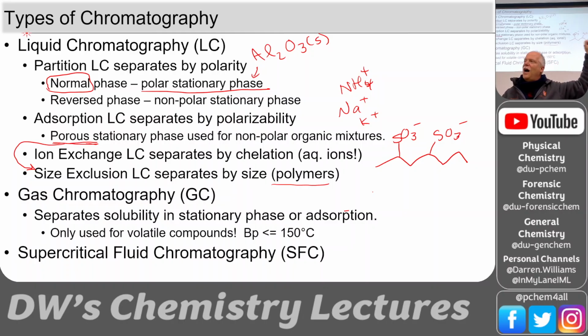So we can put a bunch of ions in one end of the column and run them past a column that has anions on it that's stationary, and the cations will come out one at a time. It'll separate them. We could also have a column of, I'm trying to think of how we do the cation columns. Are they ammoniums? I actually don't know, but we could say they are.